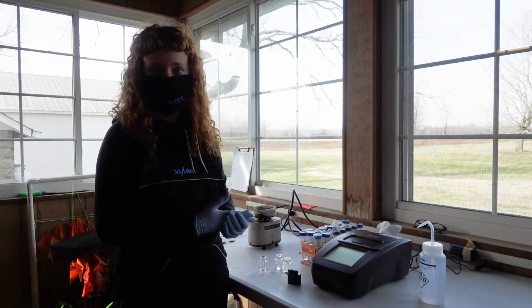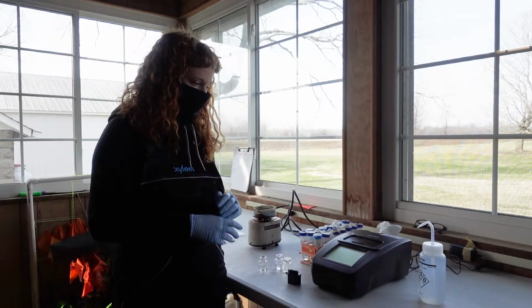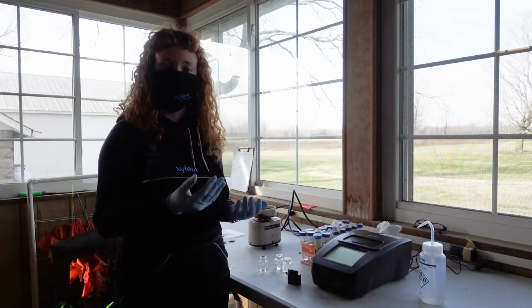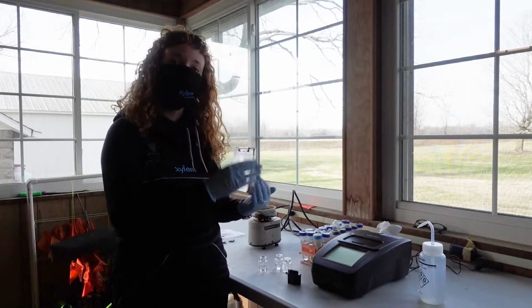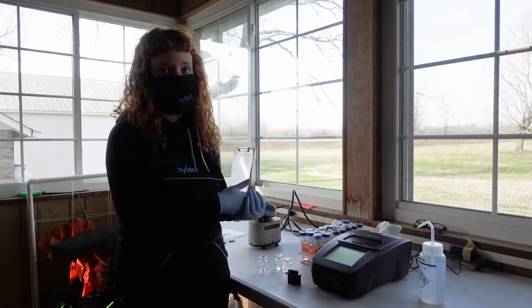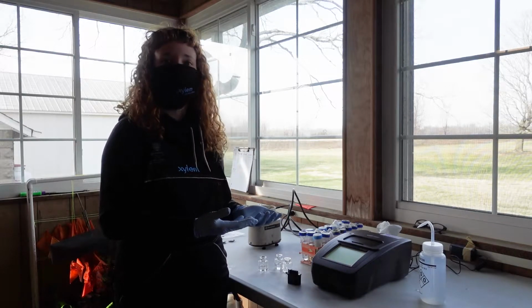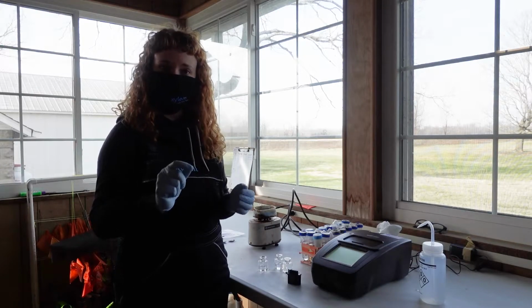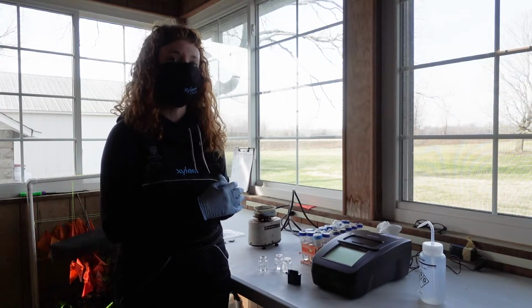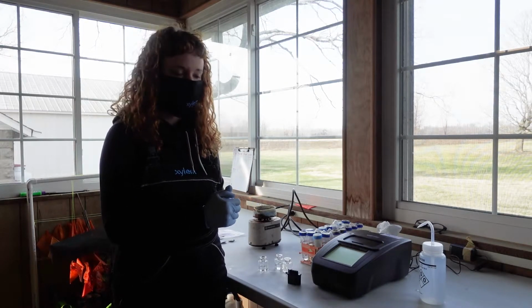We're not filtering samples in this method, so there will be turbidity in your field sample. At this point, when we measure at 750 nanometers, we're measuring absorbance due to turbidity. At 500 nanometers, we're measuring the absorbance due to the color that was created in the sample from the reagent. So what we need to do then is subtract the measurement due to turbidity from the measurement for the color so that we ultimately arrive at a measurement that is attributed only to the nitrate concentration in the sample.